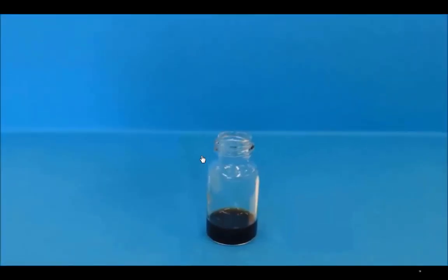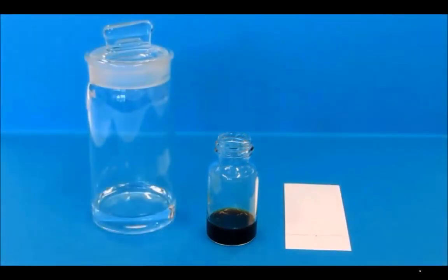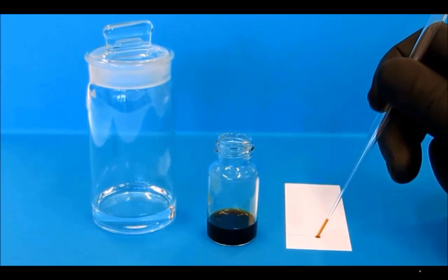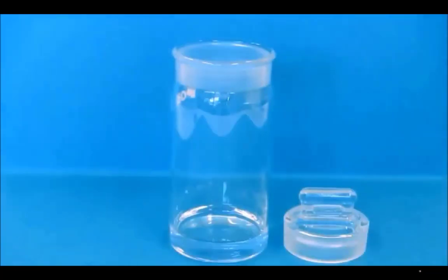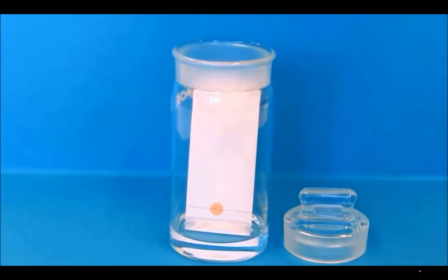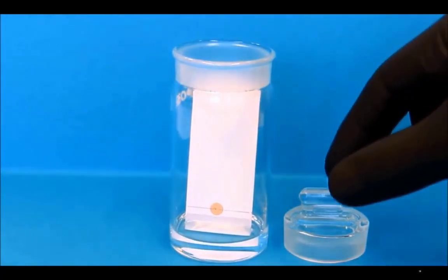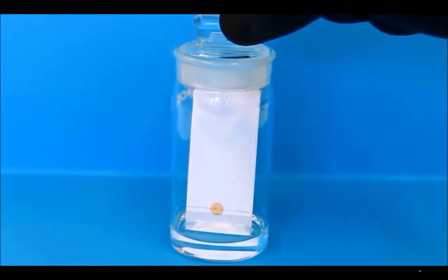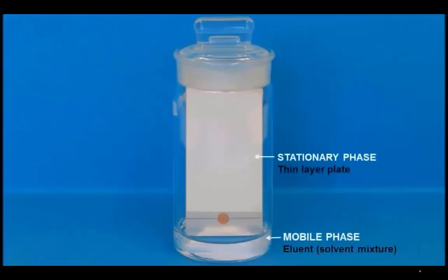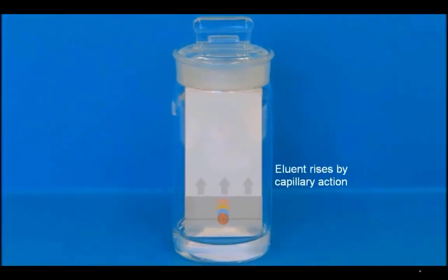In the overall process of TLC, we need a sample, a plate and a development chamber. Simply add the spot of a sample with the needle, and put that plate into a developing chamber along with the solvent at the bottom. Now this solvent rises through capillary action. The stationary phase is your plate and the mobile phase is at the bottom.